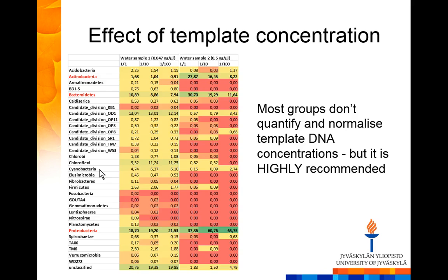It could. For example, if we just analyze these root samples with our normal prokaryotic or bacterial protocol, with the one plant species that we were working on, we got 95% of the sequences from the mitochondria of that root.